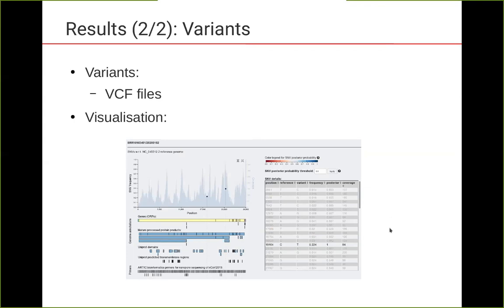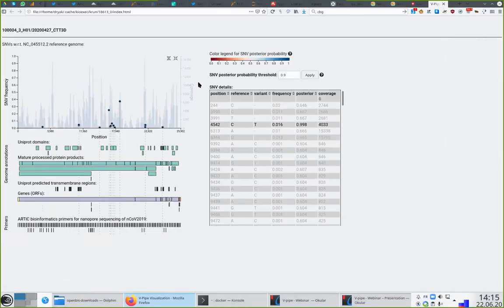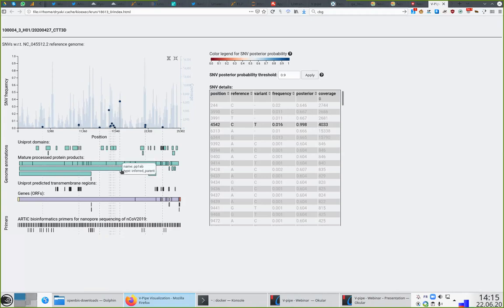There are also visual reports that you can use to visualize these variants — I'm going to show them now as they're interactive. This is the type of report you can see at the end of processing: it lists all SNVs in both tabular form and as a graphic along the viral genome. For each SNV, you can see how it falls within the annotation features provided. You can also examine the primers used in sequencing to check for coverage impact, shown in lower shading, and optionally include lower quality SNVs.